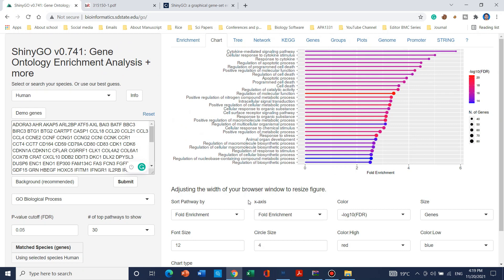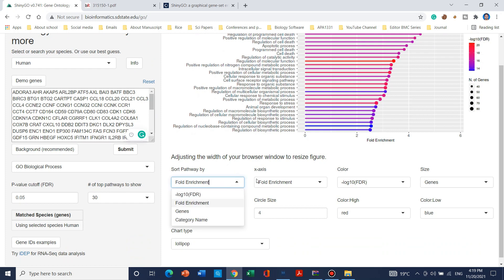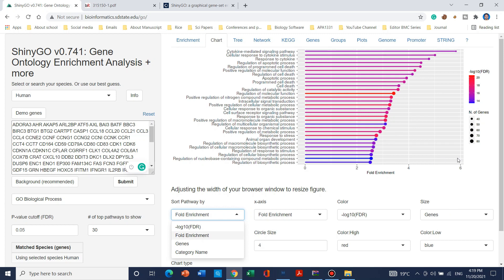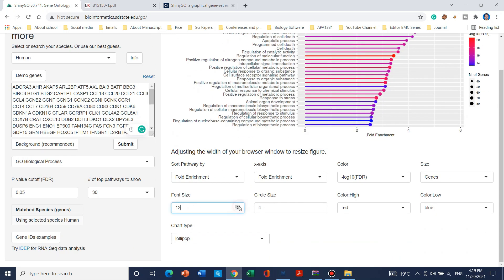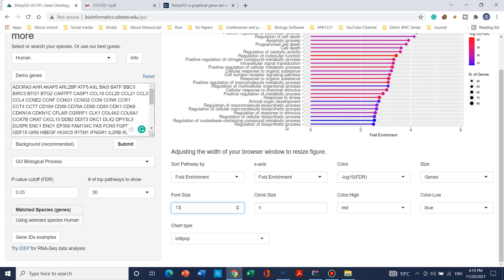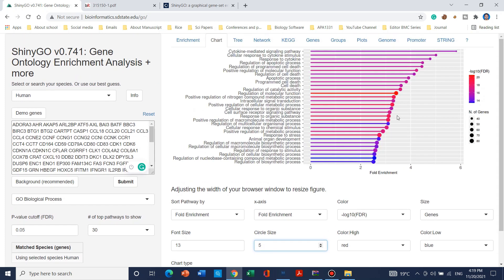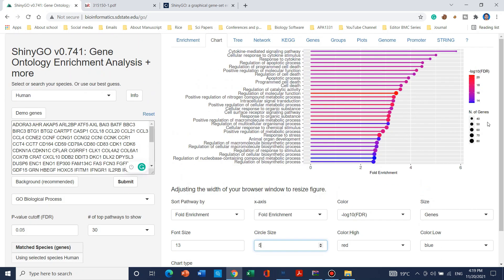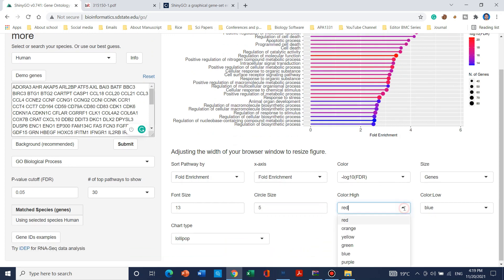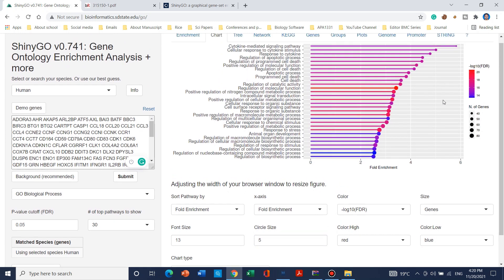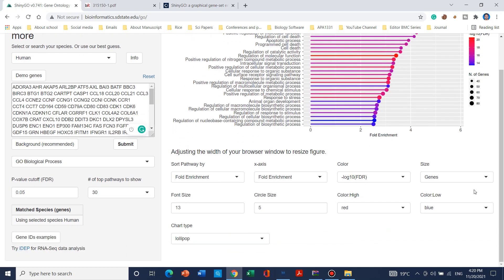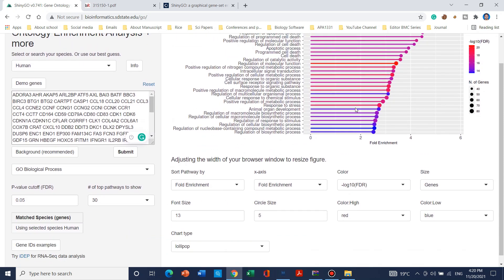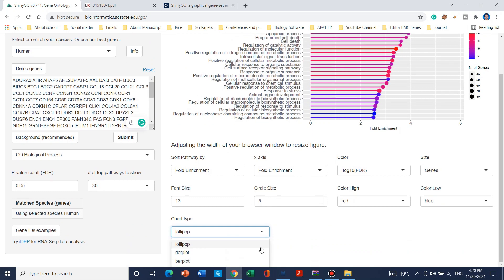We can manipulate the chart by changing the sorting and the x-axis for fold enrichment. We can also change the color, size, and font — when you click it will automatically update. We can also change the circle size; increasing it will update the chart again. Red is typically used for high values and blue for low values based on the negative log scale, though you can change these. You can also change the chart type from lollipop to dot plot or bar plot.